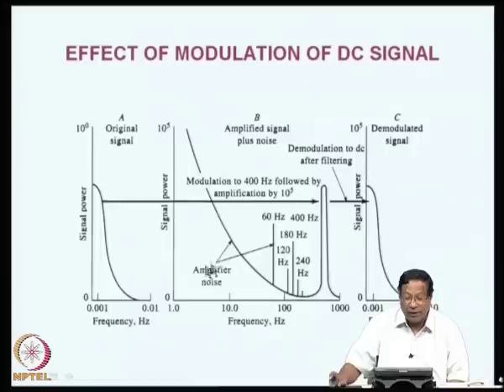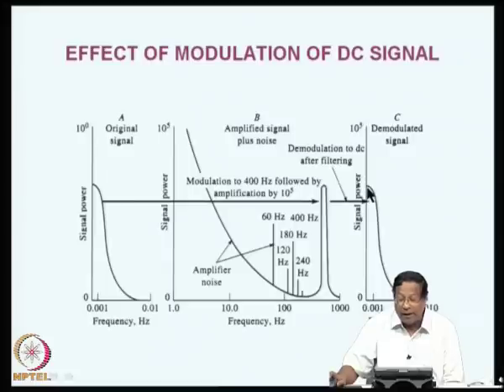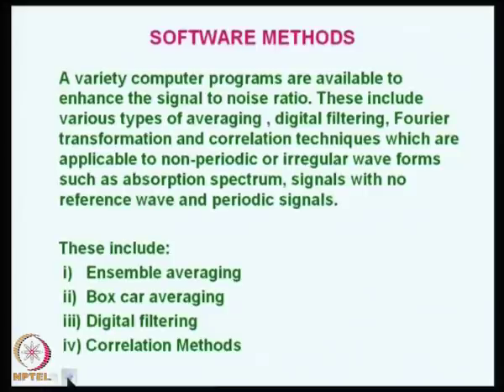Now, when we do this, you do see some amplifier noise here a little bit, but all these things will get demodulated, that means removed from the system, and then what you get here is a beautiful demodulated signal. This is the function of the lock-in amplifier.